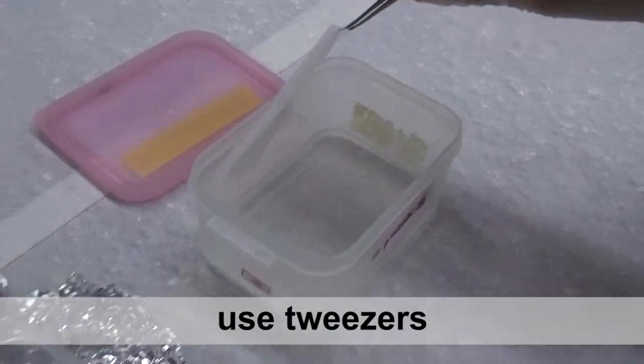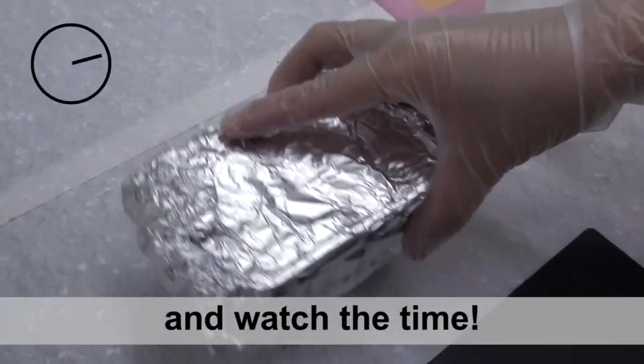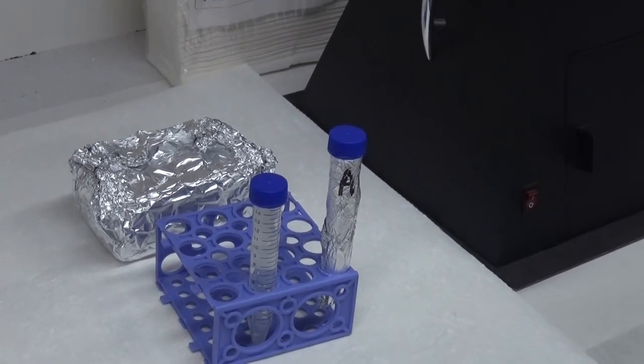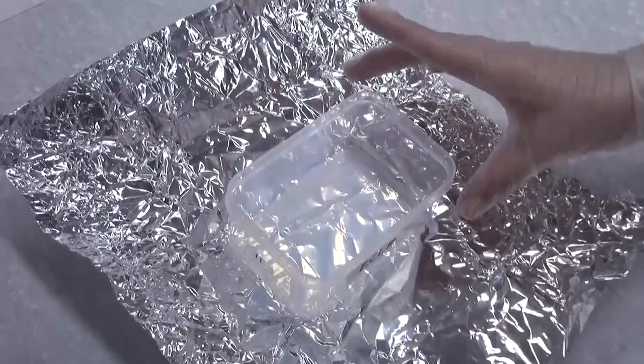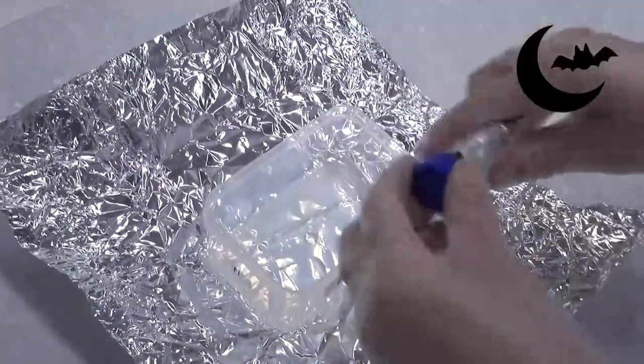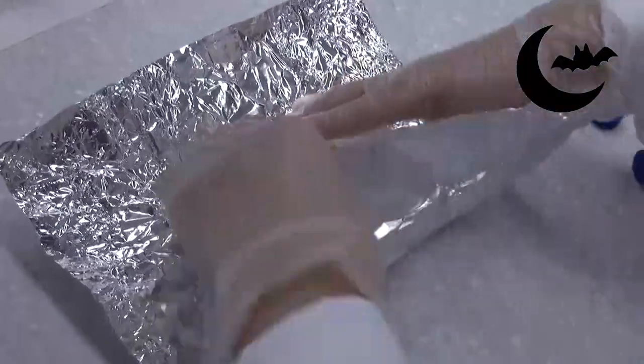Wear gloves, use tweezers, follow the order, and watch the time. The reaction starts immediately after the ECL mix solution is added; please carry out the experiment in a dark room beside the imaging system. In the dark room, mix equal volumes of solution A and B, then incubate at room temperature for 3 minutes.